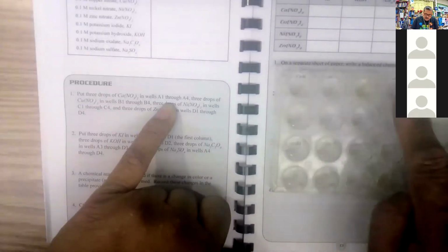And to preview the instructions, 3 drops of the chemical CaNO3 in wells A1 through A4. We'll call that A1 through A4 right there. 3 drops in B1 through 4, C1 through 4, and D1 through 4. And it says put 3 drops of KI in wells A1 through D1 going this way, 3 drops of KOH going this way, 3 drops of Na2C2O4 this way, 3 drops of sodium sulfate this way.